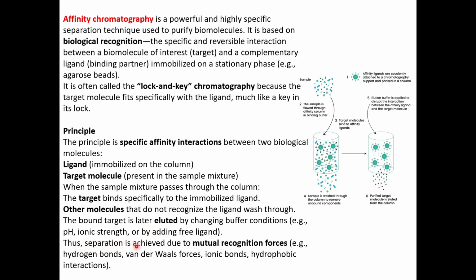So, therefore, the separation is achieved due to mutual recognition forces, which could be either hydrogen bonds, van der Waals forces, or ionic bonds or hydrophobic interactions, etc., depending on the type of target we are handling. So this is a simple illustration.